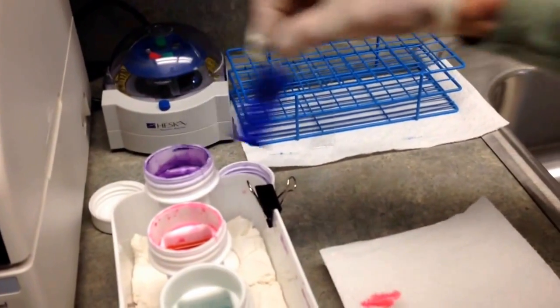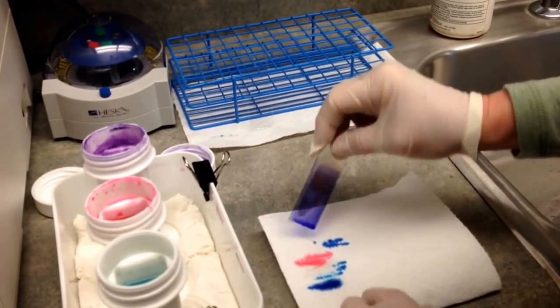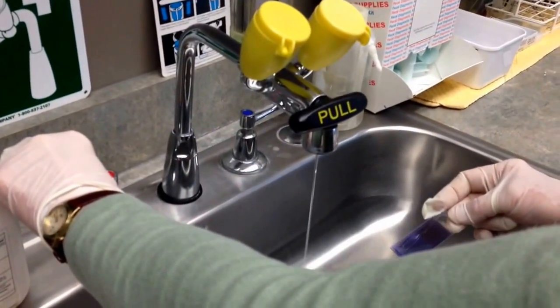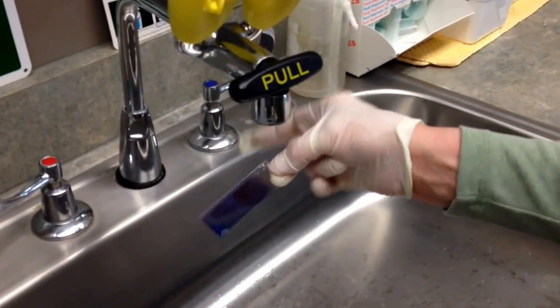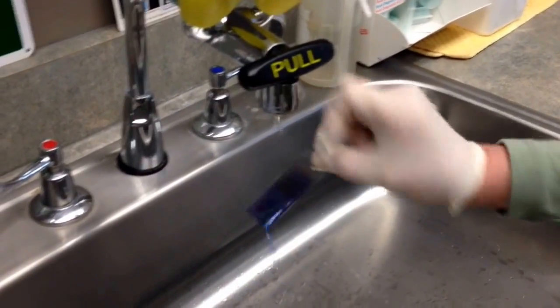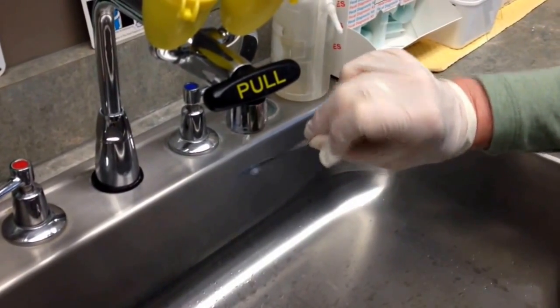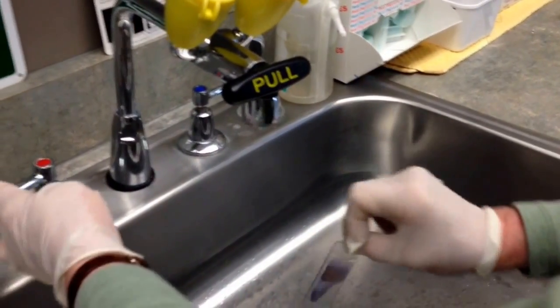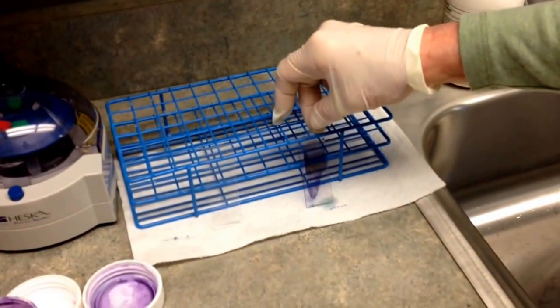Remember, cytology samples are very fragile. Even after the two fixing stages and staining, you still run the risk of losing your sample if you wash it with tap water too strongly. I like to get just a fast drip at most — place the water right at the end of the slide and let it just roll off. Don't rapidly wash this or you could end up with nothing on your slide. Do it gently until it runs clear, then set your slide aside to thoroughly dry. And that's basically how you create a slide for a cytology evaluation. Thank you.